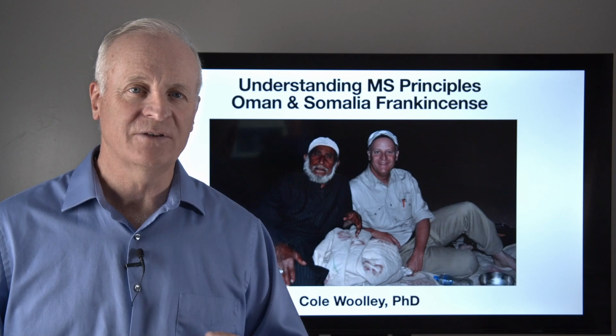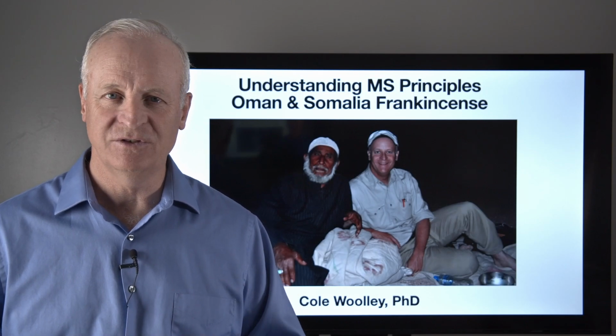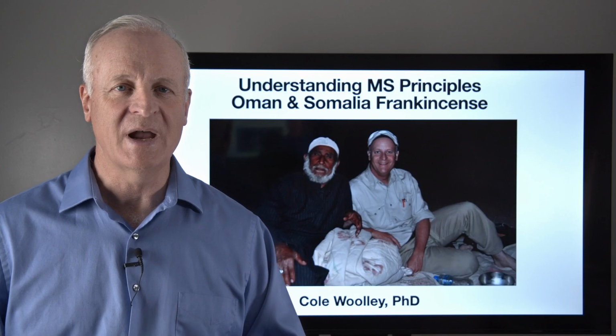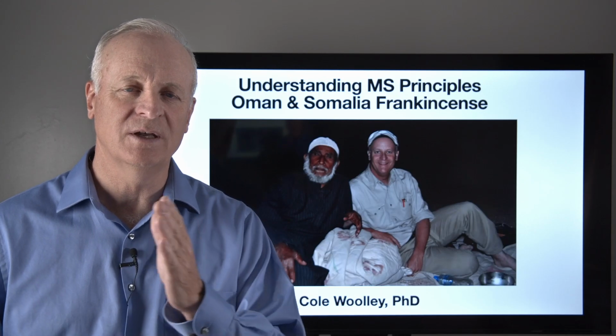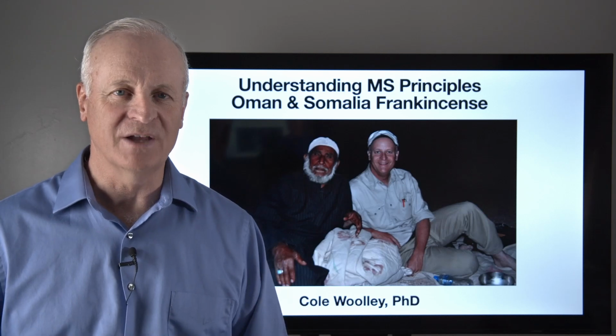So if somebody asks you, what is the job of the MS in the GCMS instrument? You can say the MS, or mass spectrometer, is a device that helps put a name with each separated essential oil component. That's the job of the mass spectrometer.